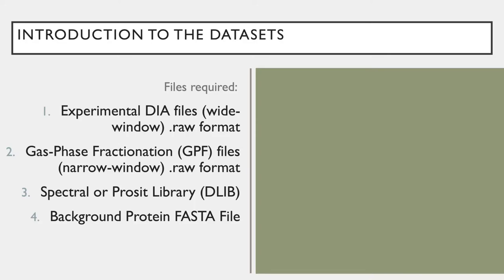When running the standard Encyclopedia workflow, four inputs are required. One, an experimental DIA dataset collection of a wide window variety. Two, a gas phase fractionation or GPF dataset collection of a narrow window variety. Three, a spectral or PROSIT library in a DLIB format. And four, a background protein FASTA file.